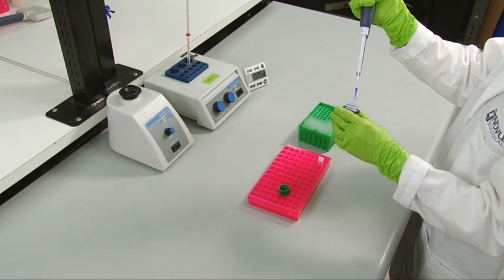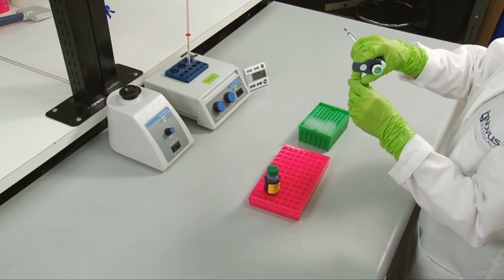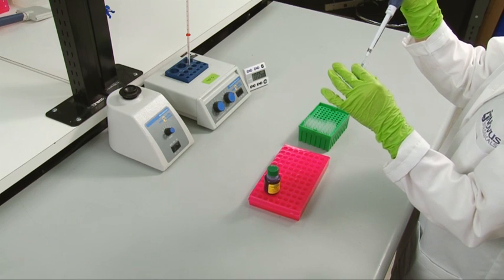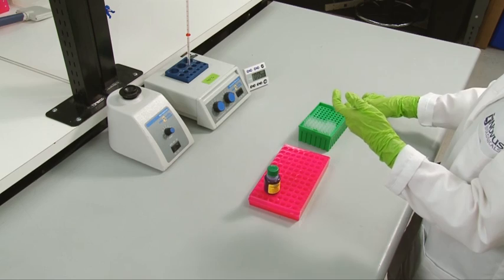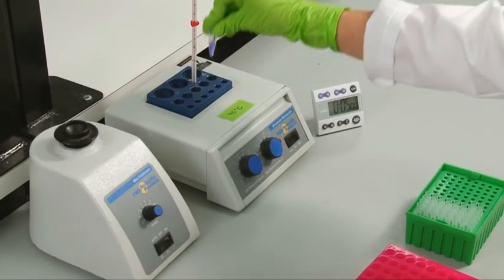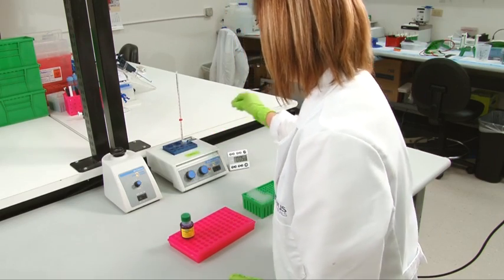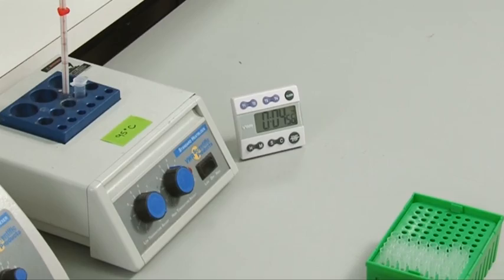This buffer contains beta-mercaptoethanol or DTT to reduce disulfide bonds between cysteines, SDS to assist denaturing and provide a net negative charge to the proteins, glycerol to allow the samples to sink into each well, bromophenol blue to visualize the lysate, and an ionic buffer. Vortex each sample and incubate at 95 degrees Celsius for 5 minutes to completely denature the proteins. You are now ready to load your samples into an SDS-PAGE gel.